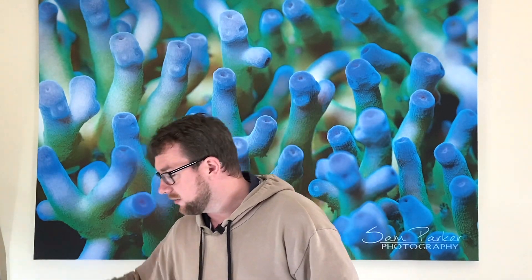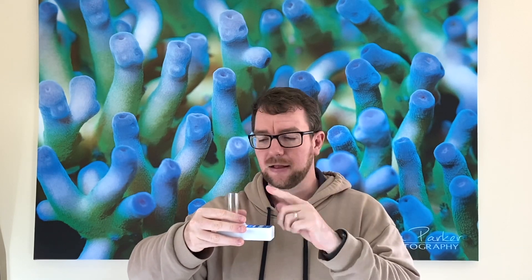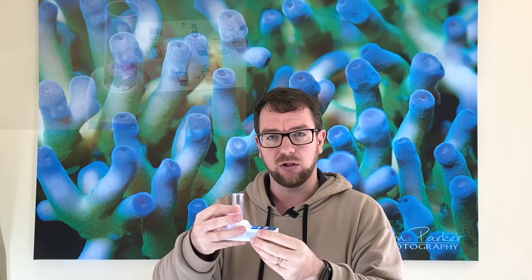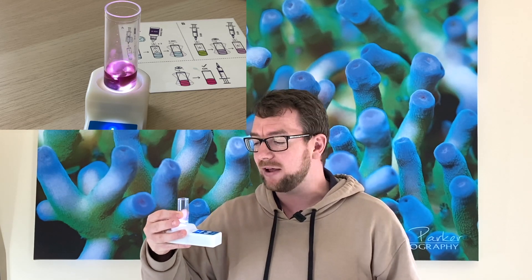Now I've talked a lot about the device without explaining what it actually is. The Taylor Speedster is a little magnetic drive — you put your sample of aquarium water on it, press the go button, and it spins a little magnetic pill around which mixes your water for you. It also has a light so it can light up your water sample, giving you a really good consistent view of the lighting and coloration of the sample, so you get a really precise measurement when looking for that color change.